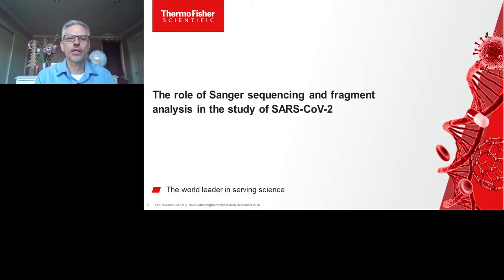I'm Steve Williams, and I lead the capillary electrophoresis R&D group within the Genetic Sciences Division at Thermo Fisher Scientific. And today I'd like to highlight the role of Sanger sequencing and fragment analysis in the study of SARS-CoV-2.